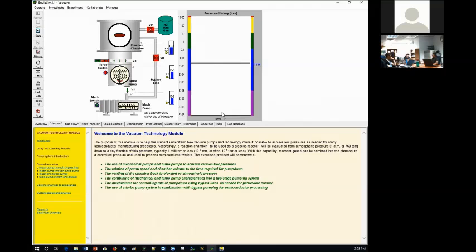So while you're pumping down your chamber over this large line, you can't control the pump down process. You can pump down some of the partial pressure of other gases much quicker while leaving quite a bit of water there. That makes sense.